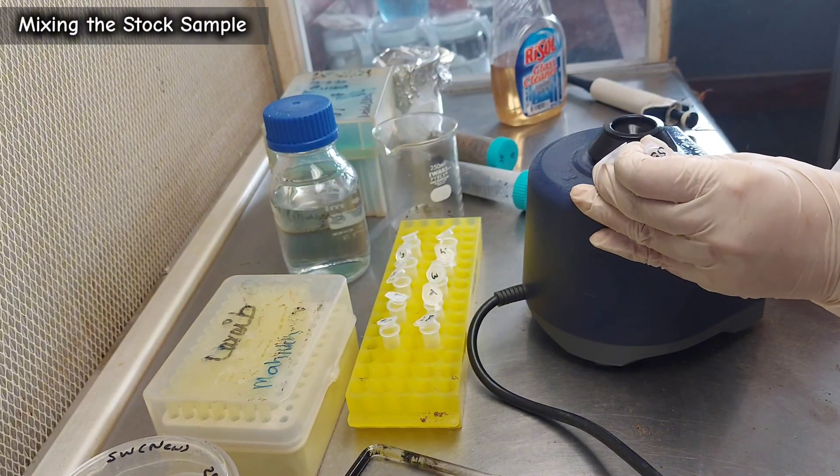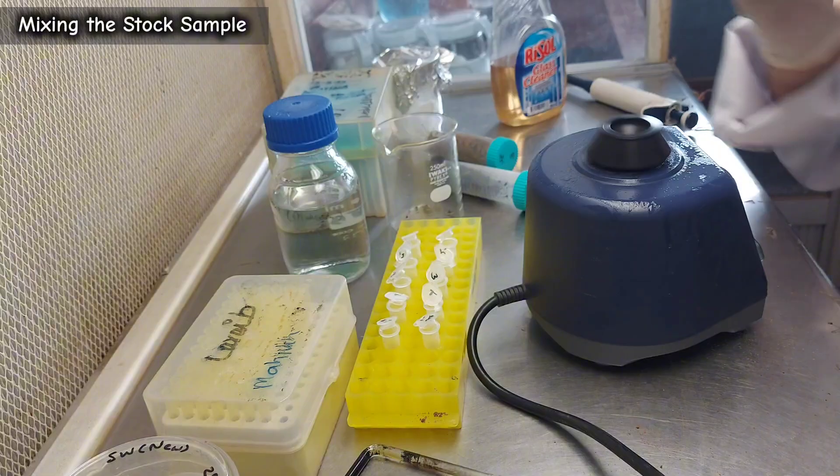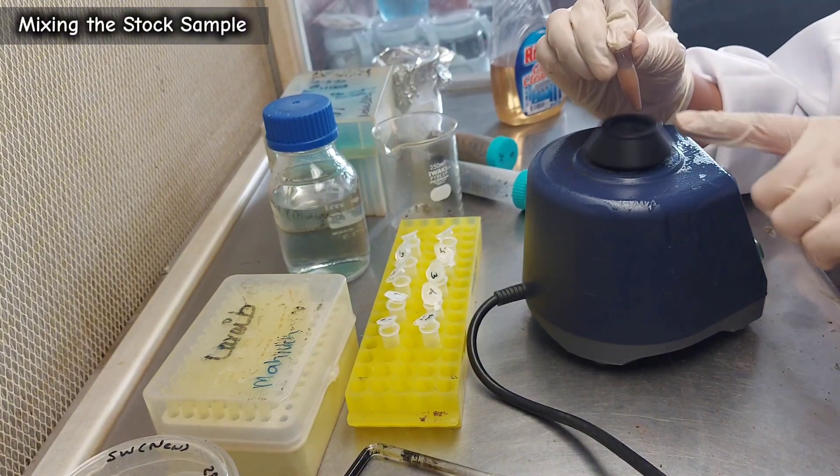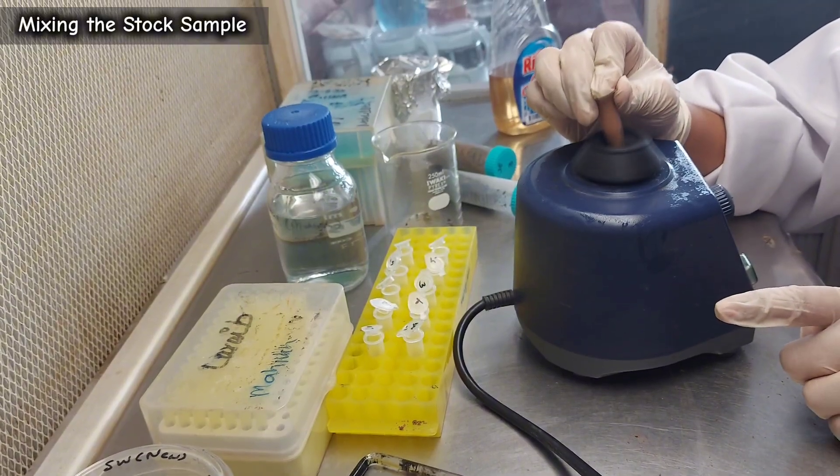Homogenize the stock sample using the vortex machine. For food microbiology, stock samples can also be prepared from food or meat, which can then be plated on selective media to isolate desired microbial flora.